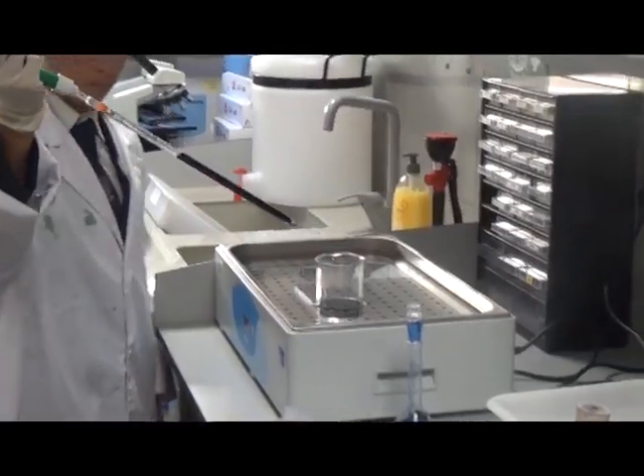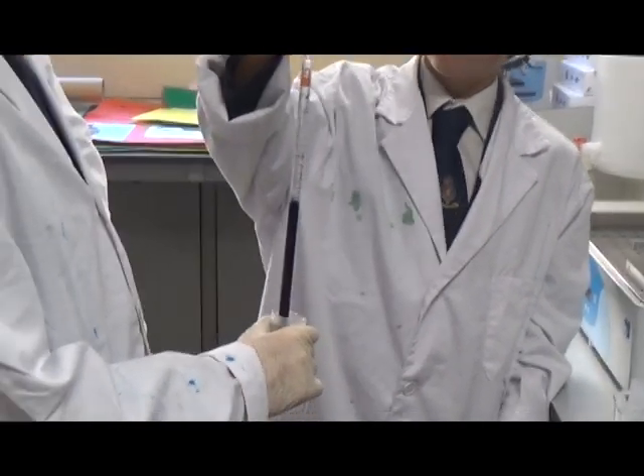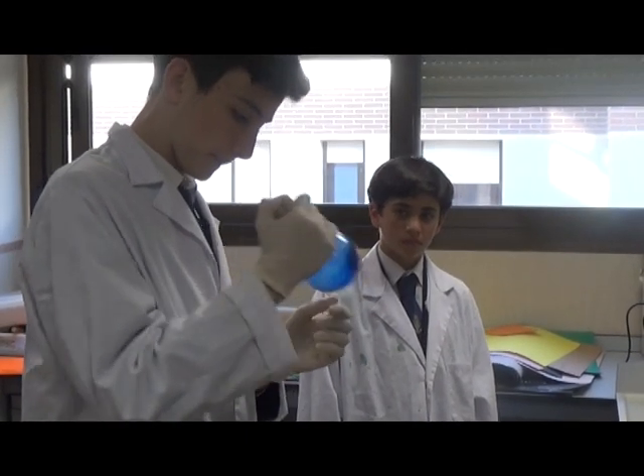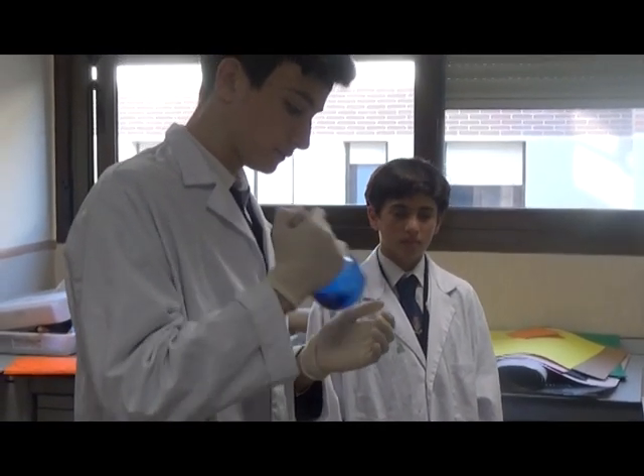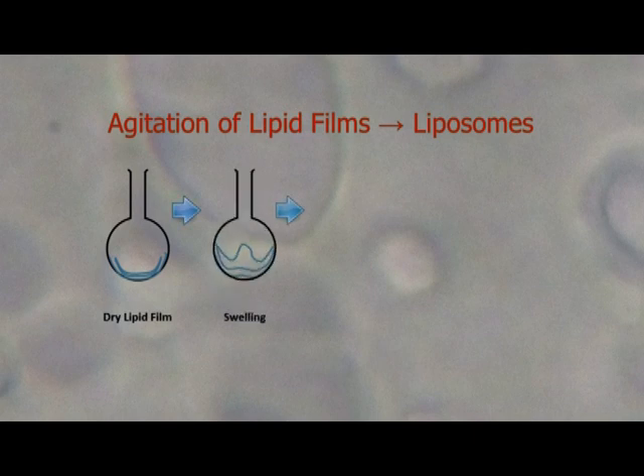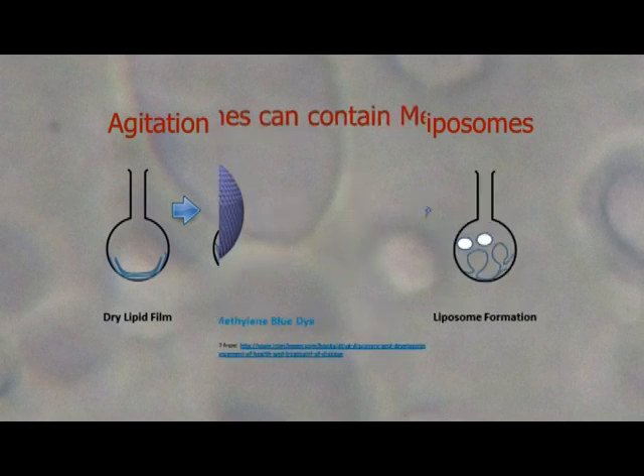Next, we rehydrate the lipid film by adding heated buffer. The buffer contains a dye, methylene blue. We shake the flask hard. The shaking causes the lipid film to detach from the glass. Once the lipids get pulled off and self-close to form tiny spheres, liposomes.